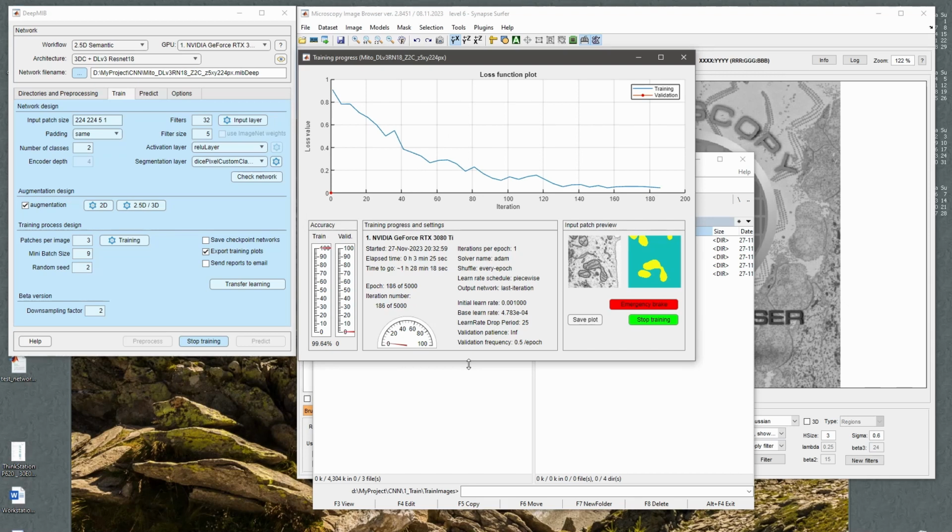We've been training this network now for 3.5 minutes. You can see that the curve is now plateauing, which means that in general the network learned the main features, and now it just tries to fine-tune a little bit the edges of mitochondria and the other things. Training longer would probably still be better, but now we can probably stop it already.